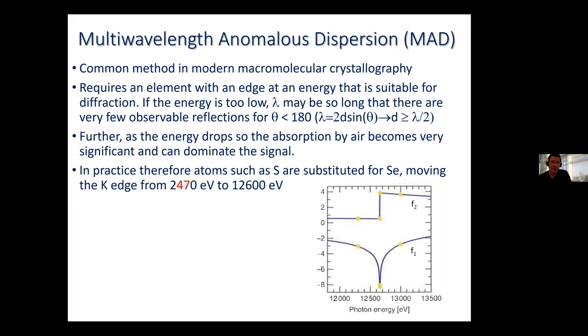This radiation has about 1/5 of the energy and 5 times the wavelength. And that's really significant because if you think about the Bragg equation, nλ equals 2d sin θ. The longer the wavelength, λ, for a given d spacing, the larger the scattering angle, 2θ. Now, the biggest angle through which you can scatter X-rays, of course, is 2θ equals 180 degrees.